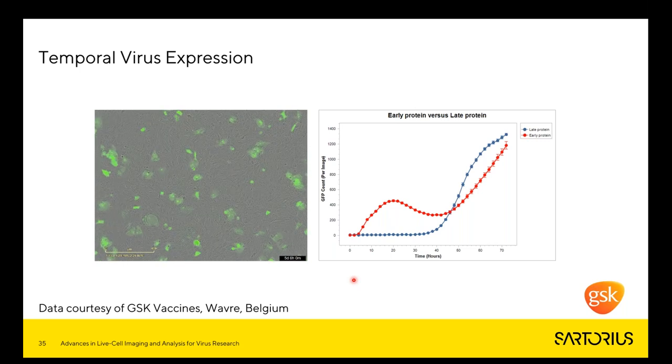So in a study that's focused on temporal expression of a protein, it's very important to collect a large number of readouts very frequently to not risk missing very valuable data points. Because let's say if you don't have an Incucyte and you were able to collect data points here, you would not see the differences in the temporal expression of these two proteins.